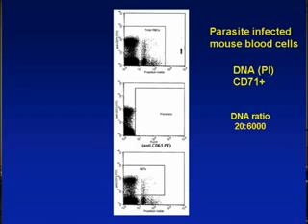But since you put in the malaria-infected red blood cells, so these are the DNA from the malaria, the parasite-infected cells. And the ratio between the parasite DNA and the normal or immature red cells DNA should be somewhere around 1 to 300. So actually it's in the neighborhood of about 200 or 300 to 1.